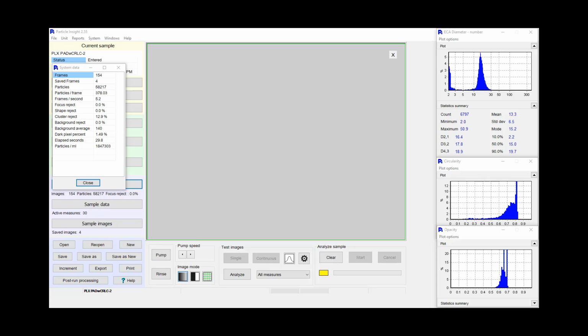It's an area of interest because stem cells are cells that are undifferentiated. They are cells that can eventually differentiate themselves into different areas. There's a large amount of research going into stem cells and how they can help with therapeutics and so forth. So it was very interesting and very pleasant to have the opportunity to look at some stem cell information, and that's what we have here.